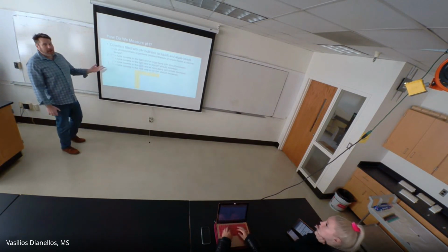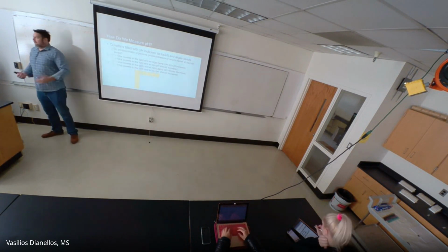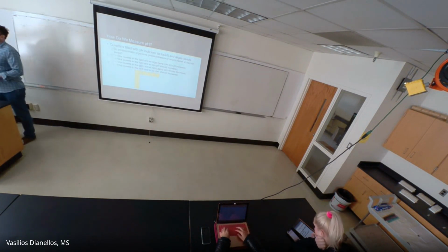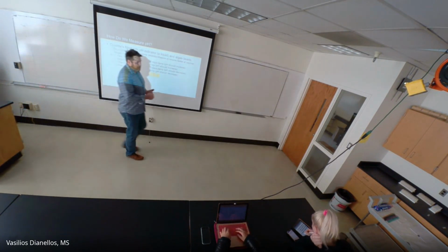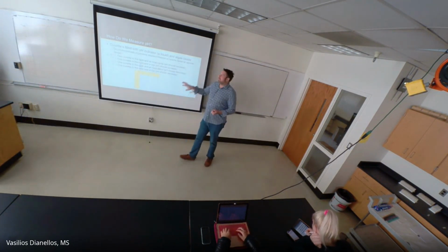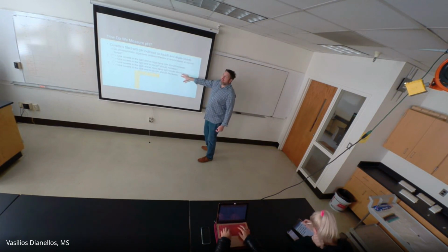So what's your logic behind it? Do you think temperature has an effect? You're going to answer why. When you answer the why part, remember we have separate experiments. When you write your hypothesis for this one, forget about the other experiment. You don't want to say something like, "I think the warmer the temperature, the more it'll photosynthesize and respire because there's more light intensity." That's where you went wrong, because light intensity was the first experiment.